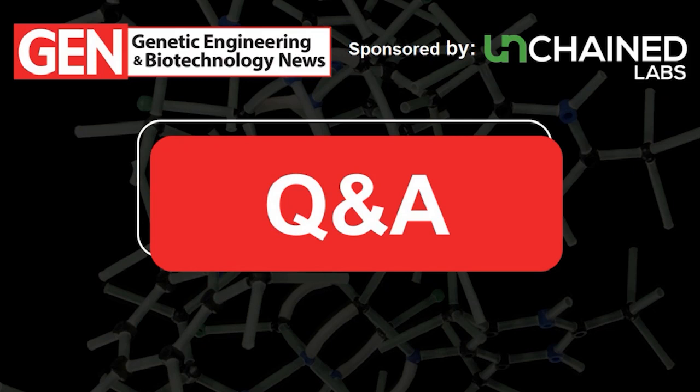And let's would like to know, is the analysis of AAV aggregates from monomers a critical quality attribute? And if so, how do you reliably measure that?